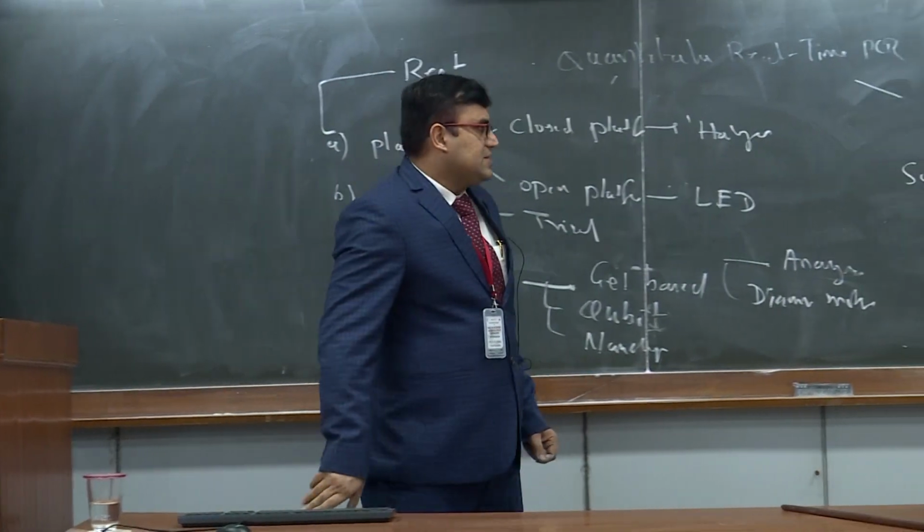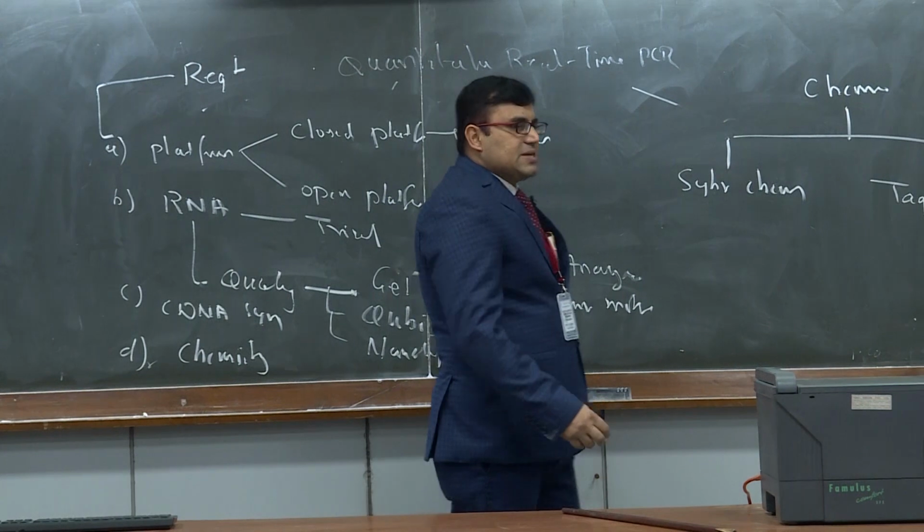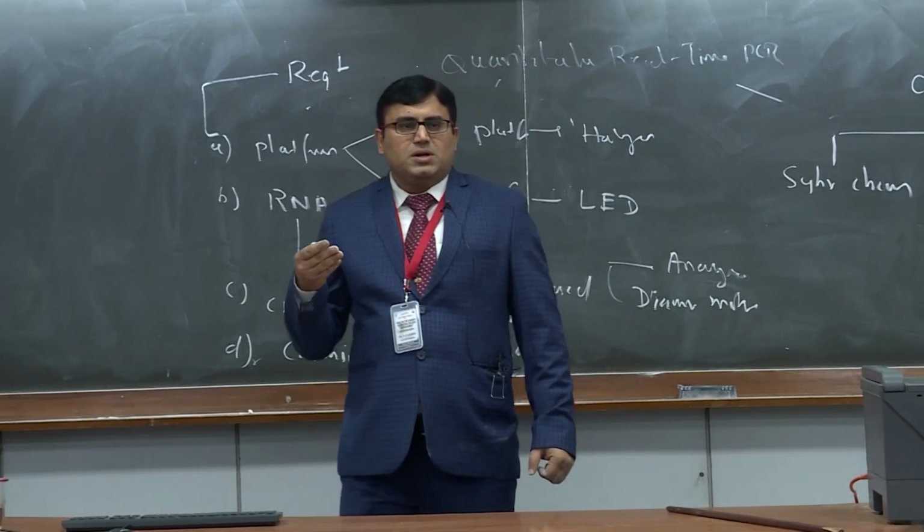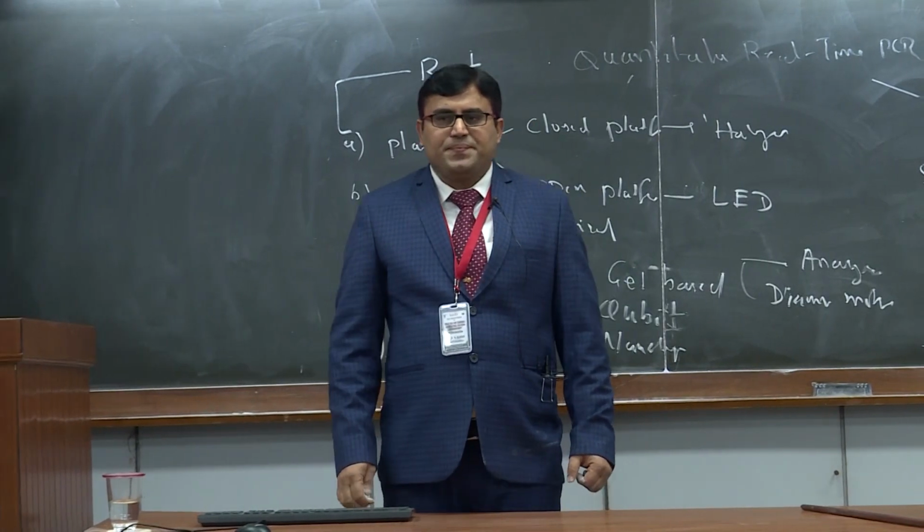I'll just brief you about the differences between these two chemistries, SYBR and TaqMan. So the first difference is that in case of SYBR-based chemistry, we are going to use a pair of primers, that is forward and reverse primer, which are gene-specific primers.